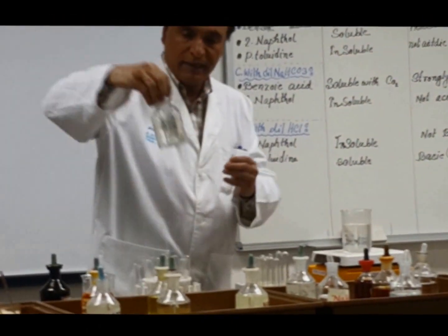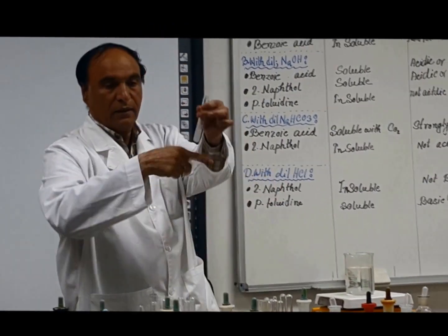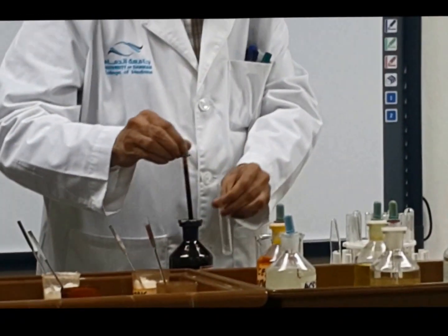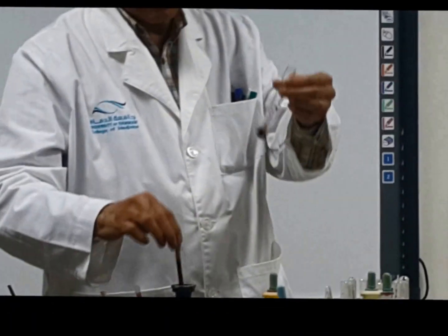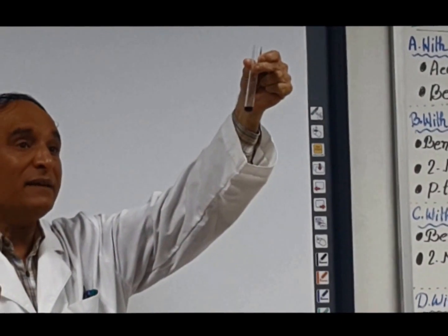I take some alkene and dissolve it in alcohol. It is soluble in alcohol. And now I will add into it 1 or 2 drops of KMnO4, which is purple in color, and you see that, look, the color changed from purple to brown. Did you see that? Change in color means decolorization, which means it's an alkene.